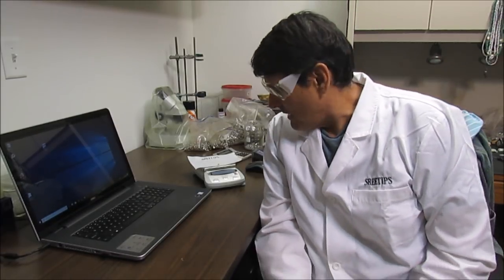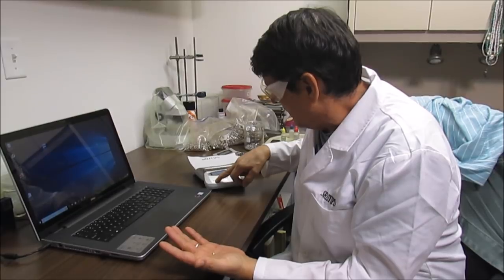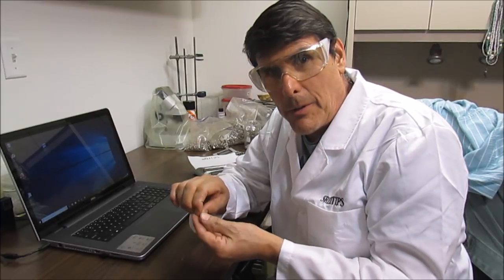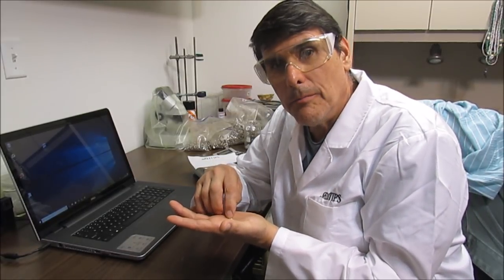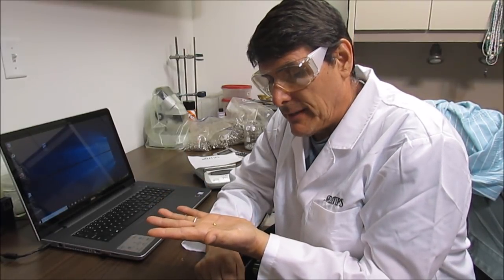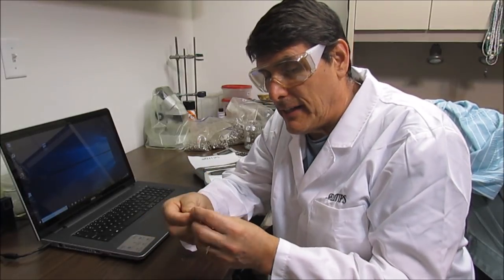Okay, this will conclude the SIM card gold recovery experiment. I was able to extract 1.7 grams of pure gold from those cell phone SIM cards. I've been working on this one for about a week, so it took a long time. I wasn't quite sure what process to use. I started with the acid peroxide, and I didn't get very many foils at all off of that. And then I went ahead and burnt the SIM cards in a metal pan, tried to extract the gold that way. Either way, I was able to get 1.7 grams of pure gold from the cell phone SIM cards. It's probably 99%. And what I'll do is I'll just throw that in with my next batch of carat scrap and refine it again into some high purity gold.